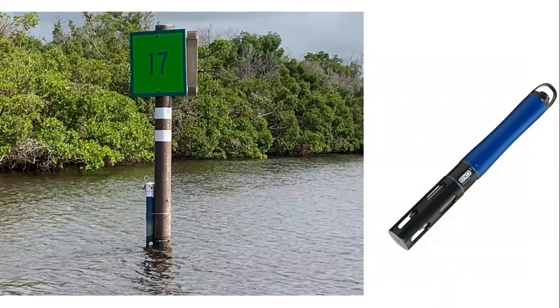Now, all those measurements we talked about take a while to do if you're using the old school methods that were in this presentation. Luckily for our water quality specialist, she uses this handy-dandy data sonde that collects this data automatically, and also some other parameters as well. It has a series of probes. It sits in the water and collects that data, and it actually gets sent up into a database.